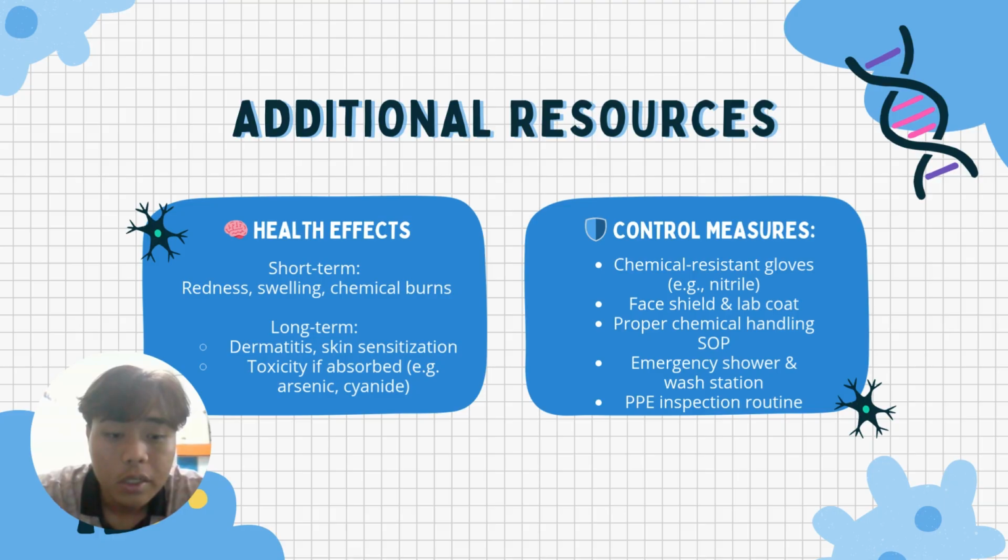In summary, proper understanding and handling of chemical hazard for dermal exposure are essential to protect laboratory workers from skin-related injury and health risks. Thank you.